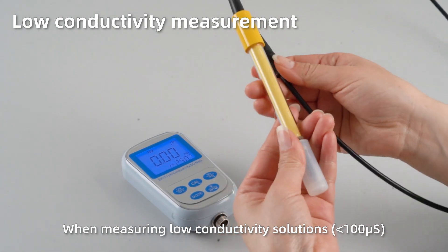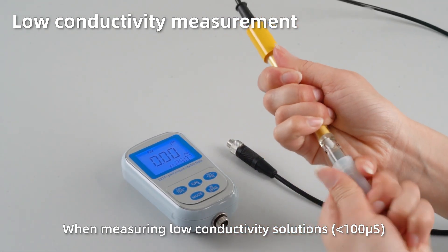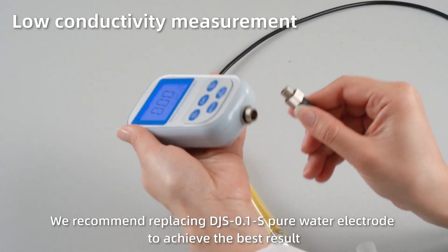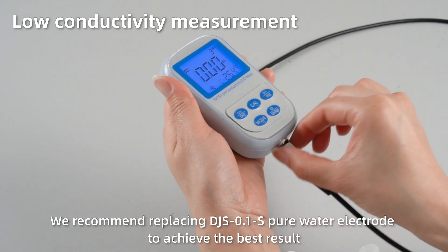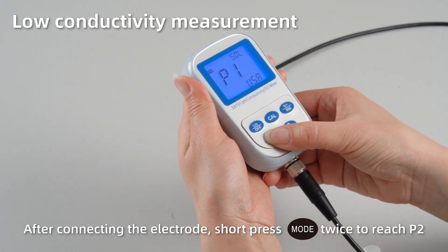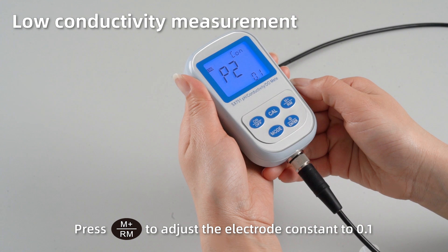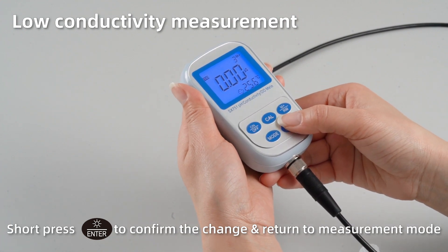Low conductivity measurement. When measuring low conductivity solutions, we recommend using the DJS-1S pure water electrode for the best result. After connecting the electrode, short press Mode twice to reach P2. Press M+ to adjust the electrode constant K to 0.1. Short press Enter to confirm the change and return to measurement mode.